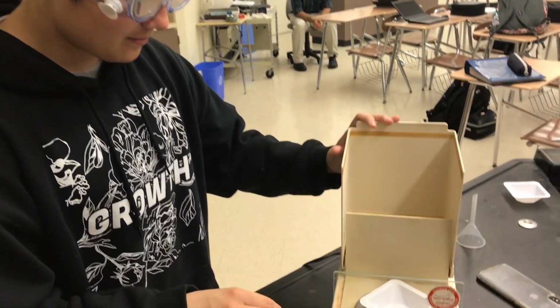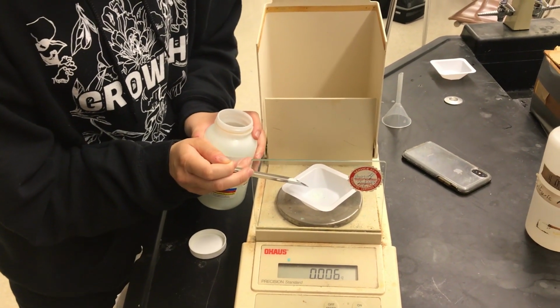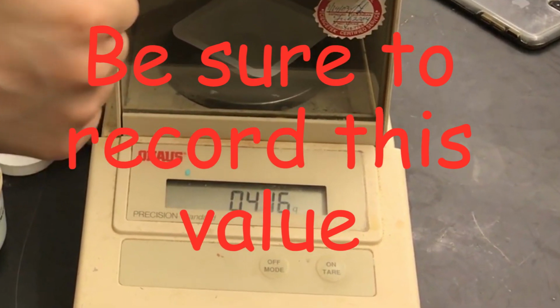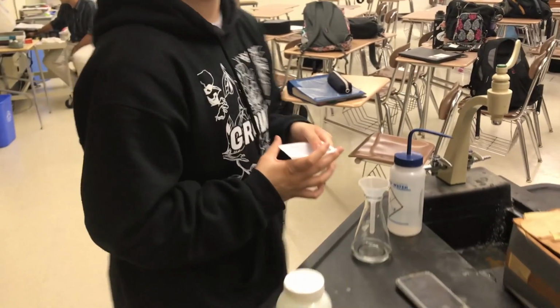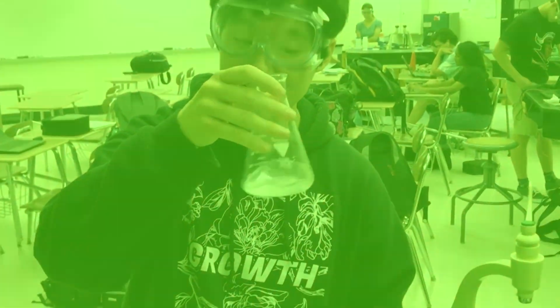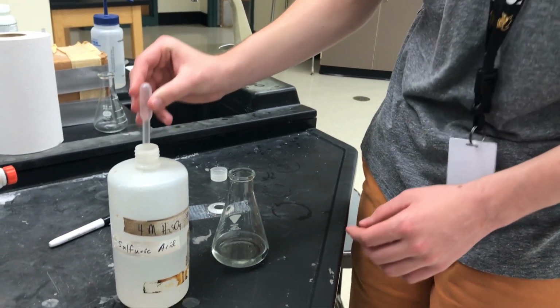Now we have to record 3 significant figures worth of ferrous ammonium sulfate, or FAS. Now I pour it into the Erlenmeyer flask, and swirl. Now we're going to add a few squirts of H2SO4.